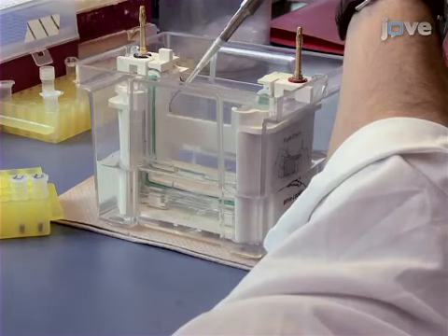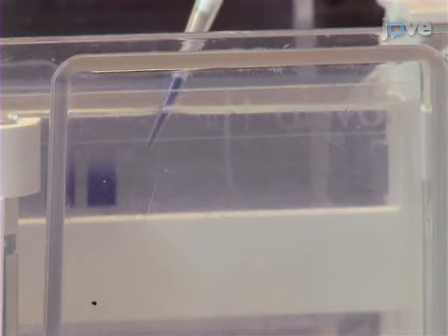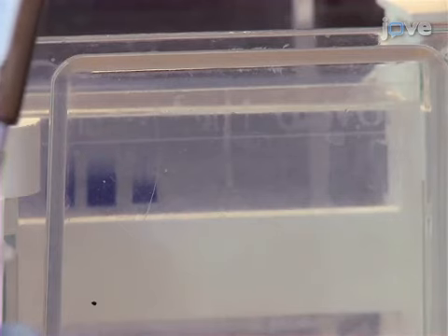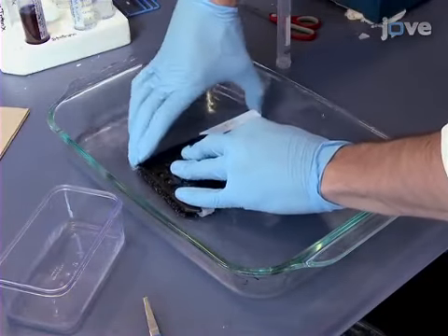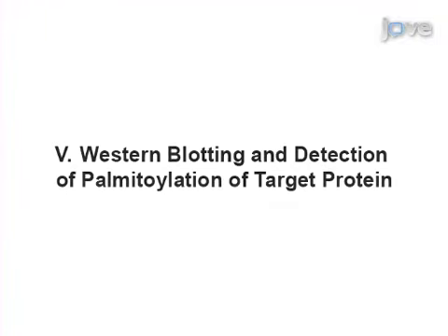After boiling the samples and centrifuging again, add the complete volume of eluted protein in the supernatant from each sample to a single lane within a polyacrylamide gel suitable for Western blotting using SDS-PAGE. Organize all samples so that the minus HAM control eluent and plus HAM eluent for a single sample are run immediately adjacent to one another during SDS-PAGE. Following SDS-PAGE, transfer to a PVDF or nitrocellulose membrane. Begin Western blotting with washing and blocking as described in the written procedure.